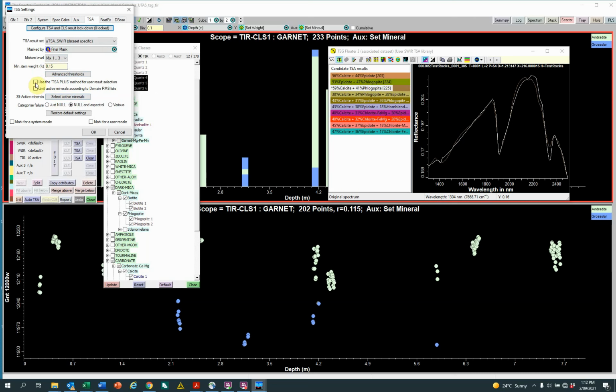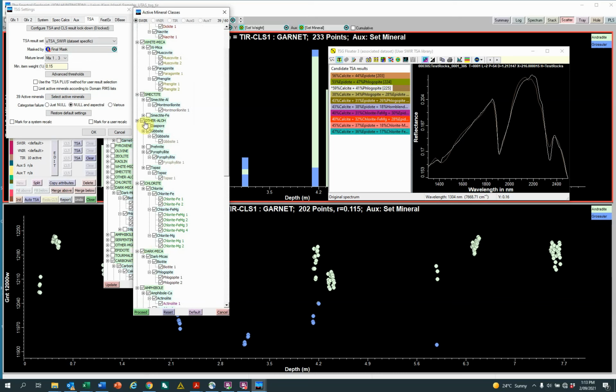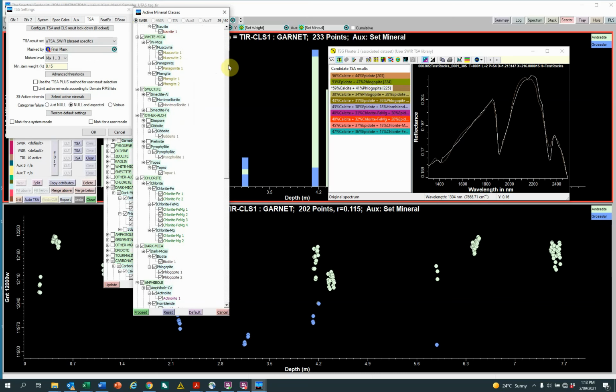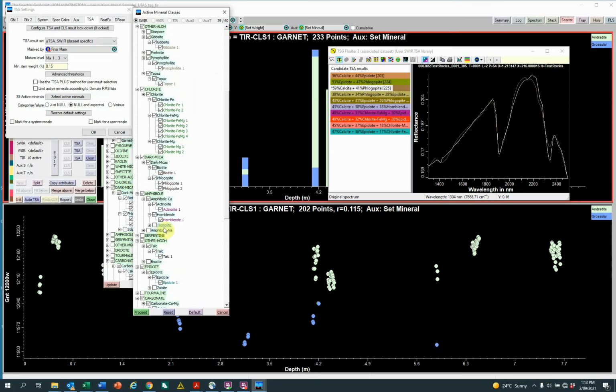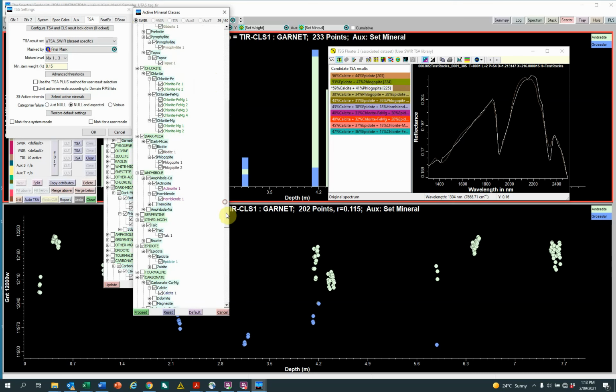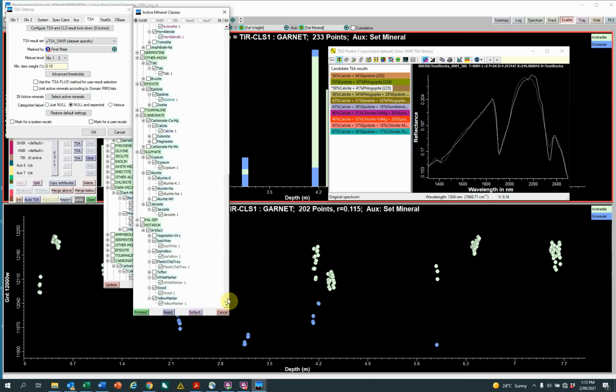And we select the active minerals right here in a list, and it looks very similar to the one we just saw. So I'm in the shortwave infrared, and see all the minerals are turned on, almost. There's a couple of furphies like sodium amphibole that are turned off by default, but you can turn them on, and a few weird ones like dolomite, not very common.